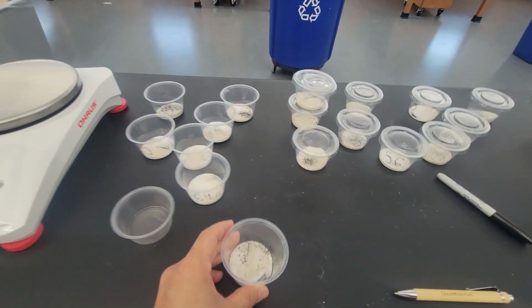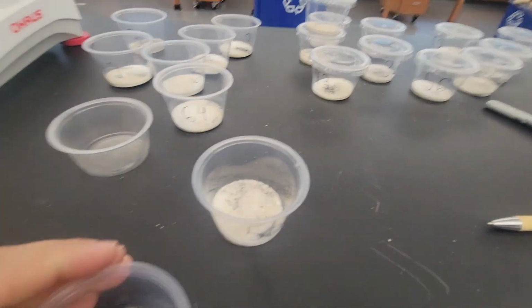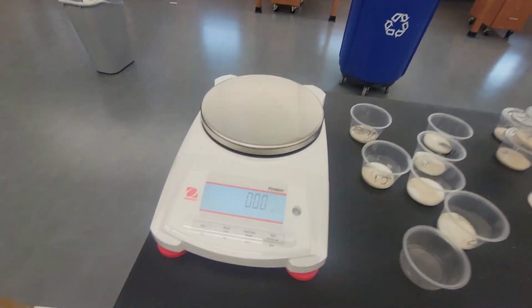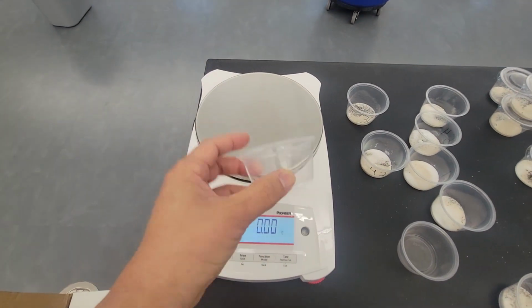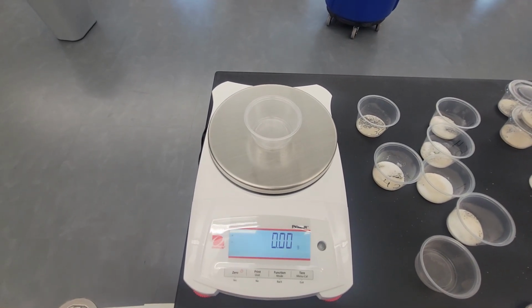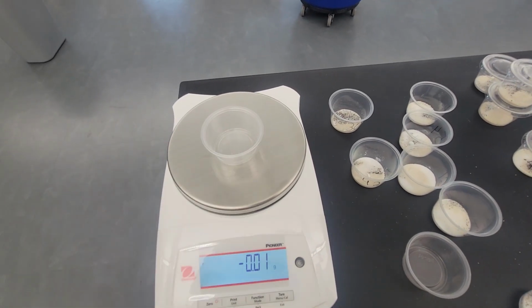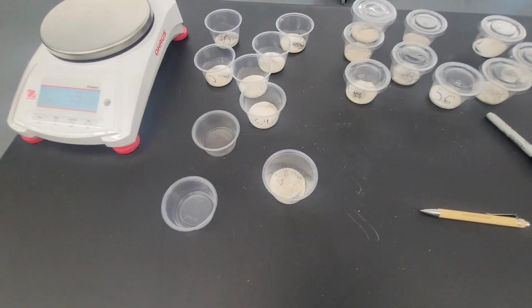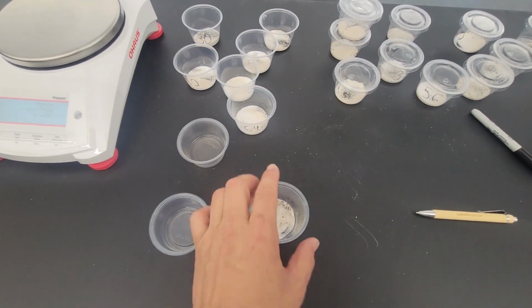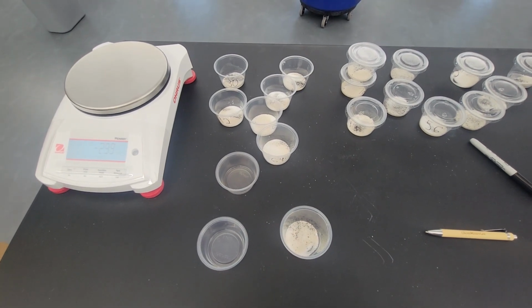First, I'm going to get a weighing cup to separate the iron. So I got a scale. Nothing in there. Zero that out. And I'm going to collect my iron in there. So I'm going to need a magnet because iron is attracted to magnets while salt and sand are not.